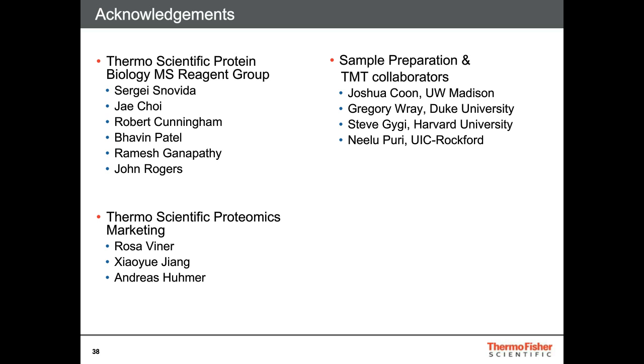Okay. When using the TMT 10-plex, which tag should be used to label the internal standard? We used TMT 126, but I saw you use TMT 131. That's a good question. It doesn't really matter, I think, in theory. One thing I will say is that if you've used TMT before, it does come with a data sheet, and the data sheet includes some isotope impurities that are present in the individual tags.